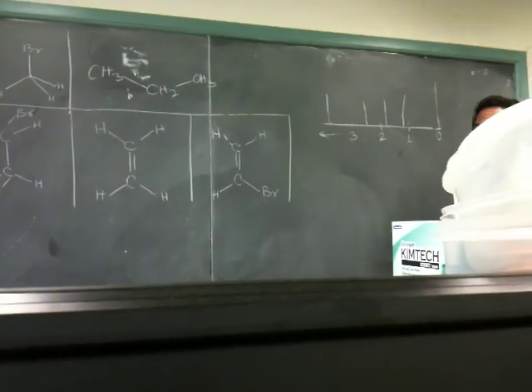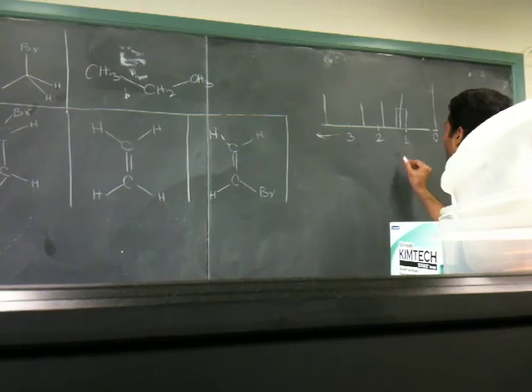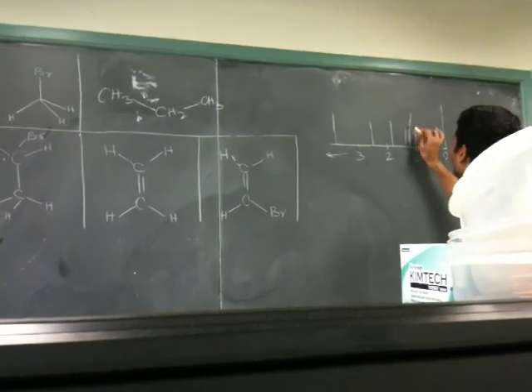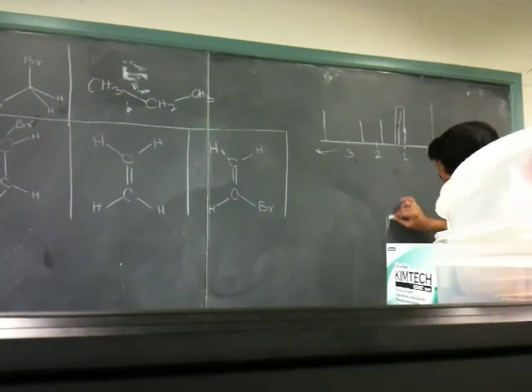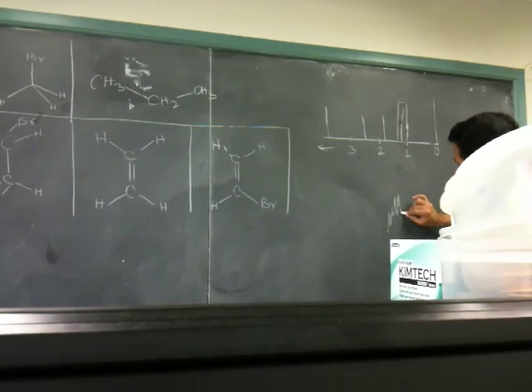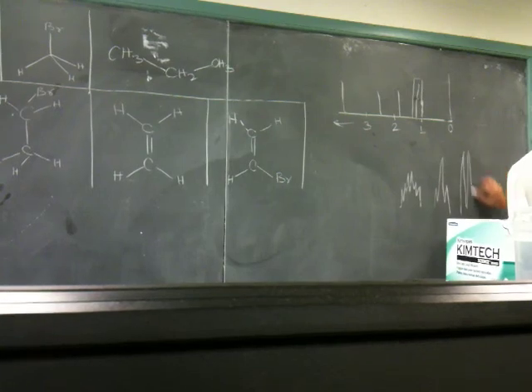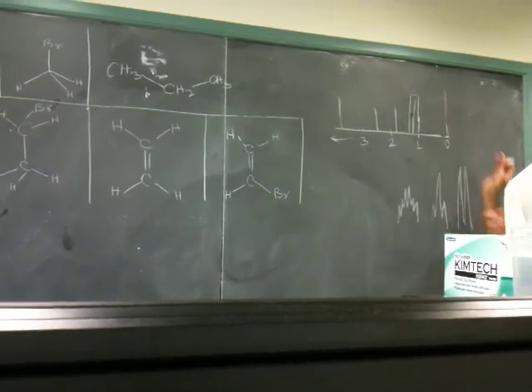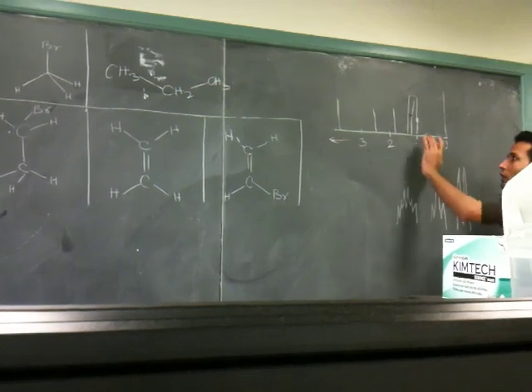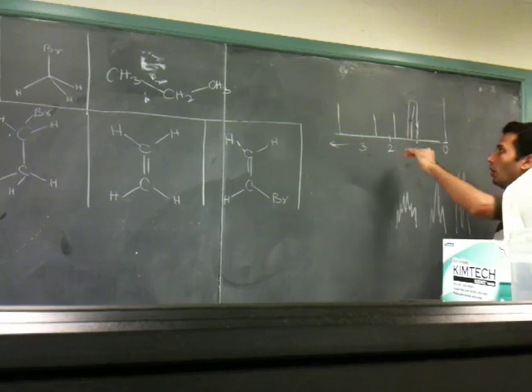In the higher resolution picture, what you will see is this peak. You can blow it up, and say if you blow this single peak over here, you might see something like this, or like this, or like this, or any different type of structure. You can see any of these structures in this one peak if you use a better resolution picture or a better instrument.